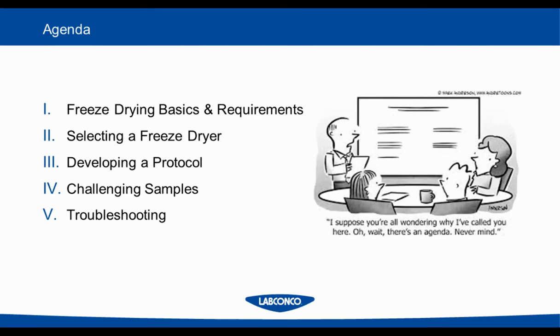We're going to start by discussing a general overview of the freeze drying basics and requirements, followed by how to select the right freeze dryer for your application. Then I'm going to pass things off to Jenny, and she'll talk about developing a protocol, freeze drying challenging samples, and troubleshooting.